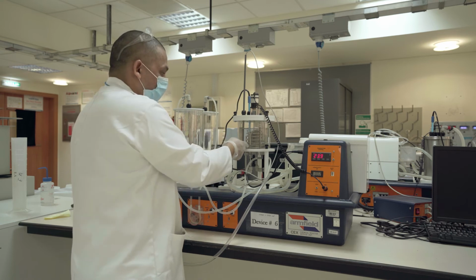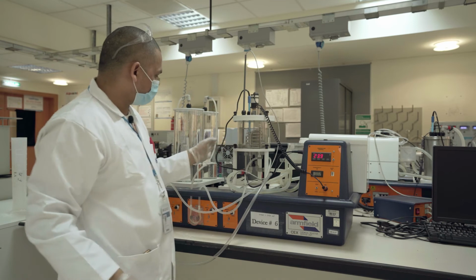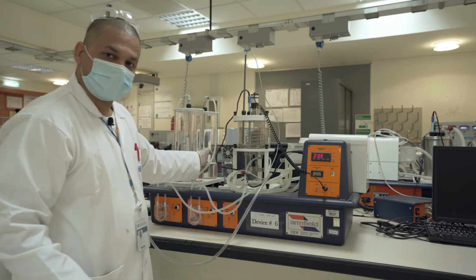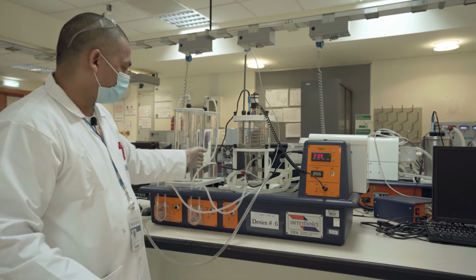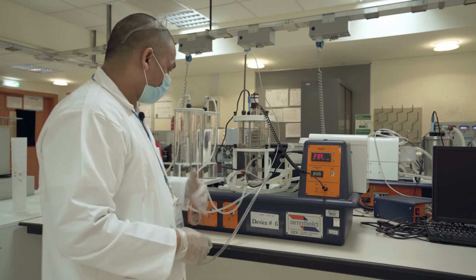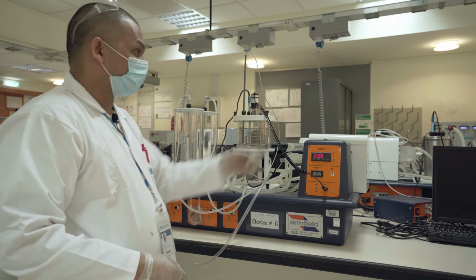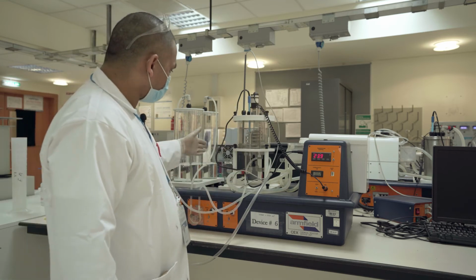We are measuring the conductivity here. Right now it's very low because I am just using DI water, so the conductivity is very small, just 0.02. But when the actual sample is used, you get conductivity around 0.8 or so, like the 0.85 that we saw there.